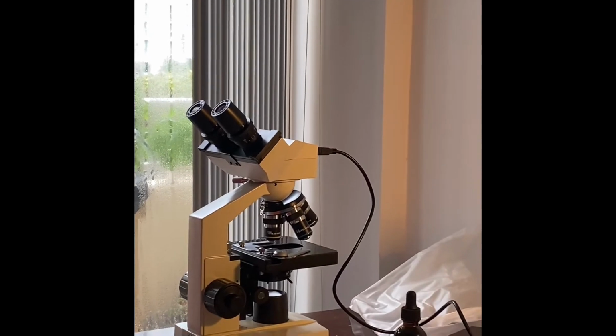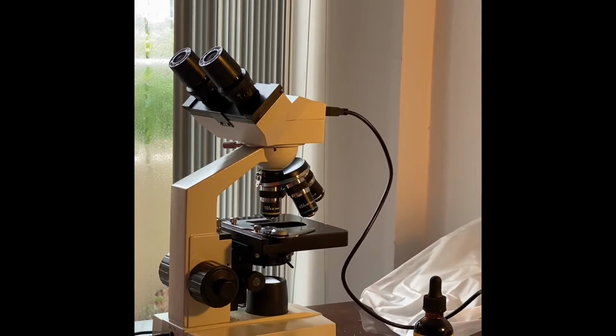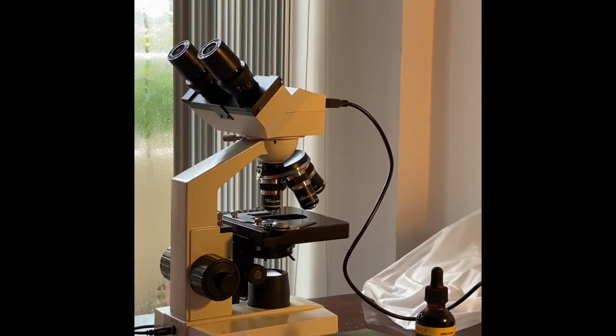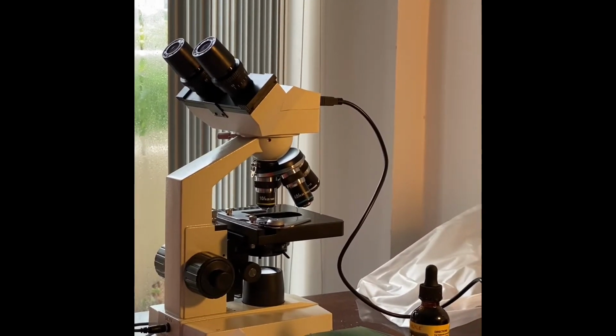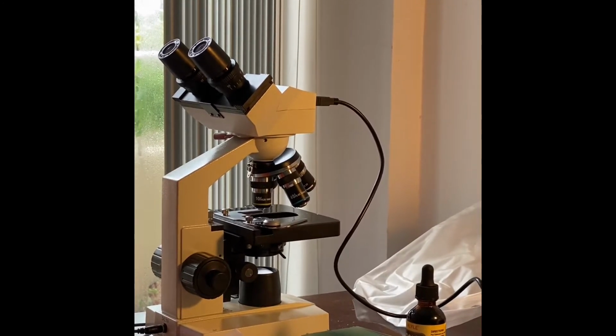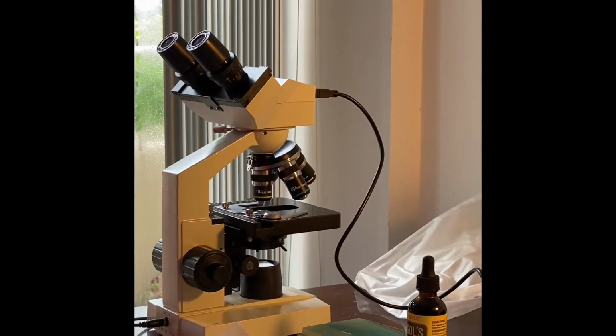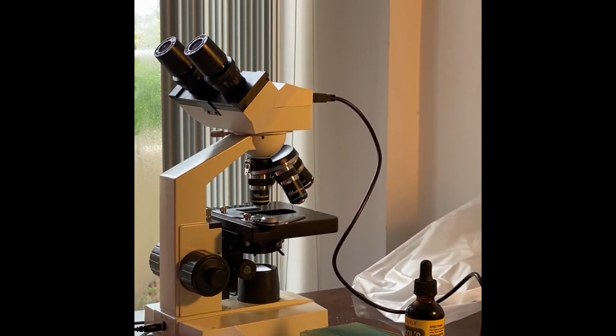The purpose of this activity is to identify the similarities and differences between plant cells and human cells. A cell is the smallest unit of life. A group of cells makes tissue. Today we're going to look at onion cell.